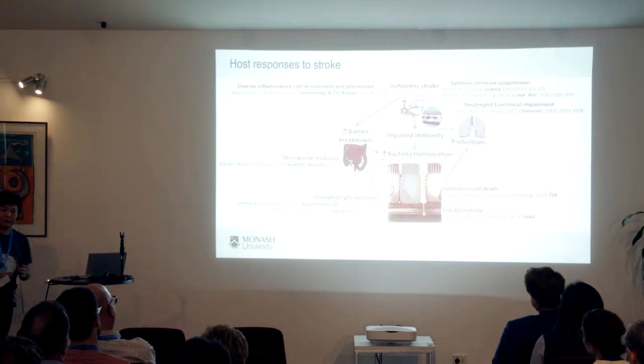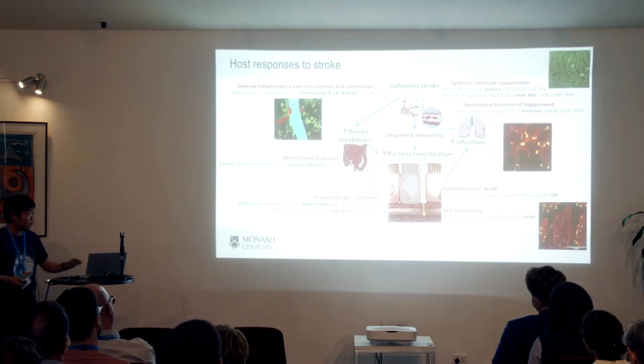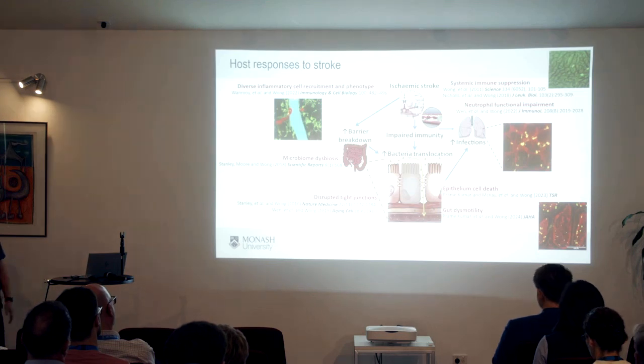Of course, I can't tell you everything that we are doing in the lab. I really wanted to show you is that we can use intravital microscopy to study a lot of these processes, all the way from the brain, liver, lung, the gut, and different parts of the gut as well.